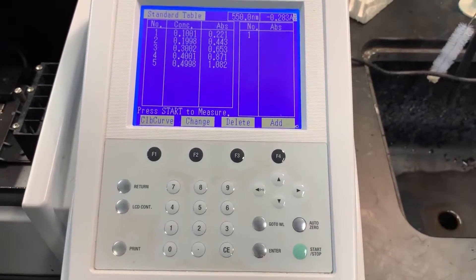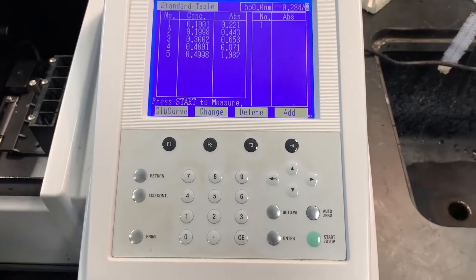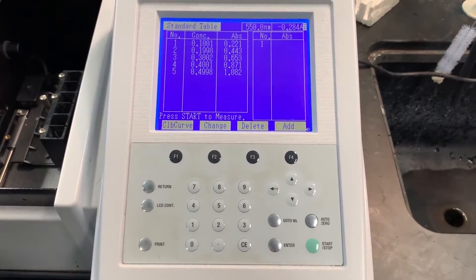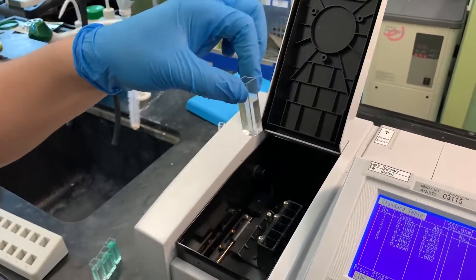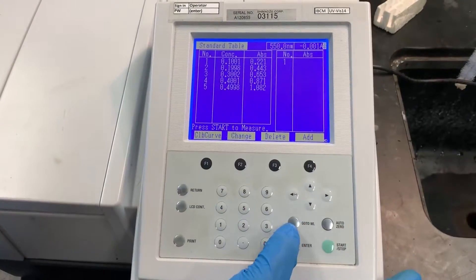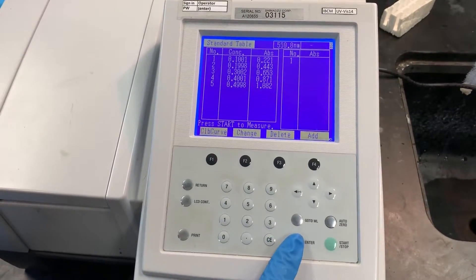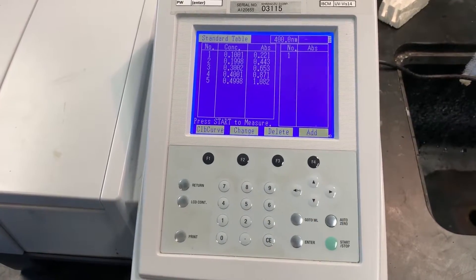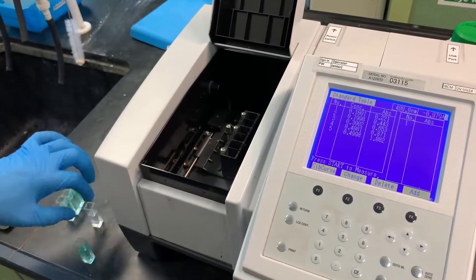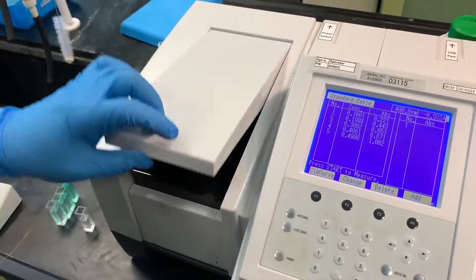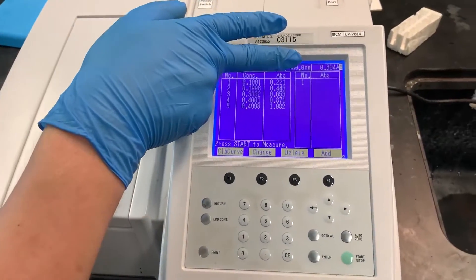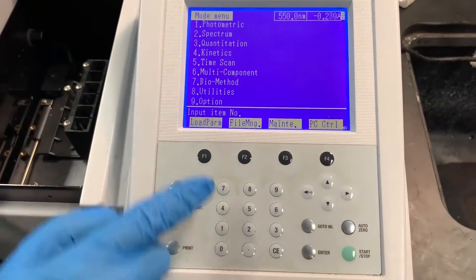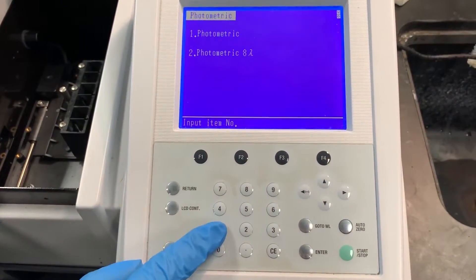The UV visible spectrophotometer may also be used to find the absorbance of an unknown sample. To calibrate the machine, place a blank cuvette in the machine, select go to wavelength, and select the desired wavelength. Then select auto zero to calibrate the machine. Replace the blank cuvette with a cuvette containing the unknown sample, and the absorbance value will be shown on the top right of the screen.